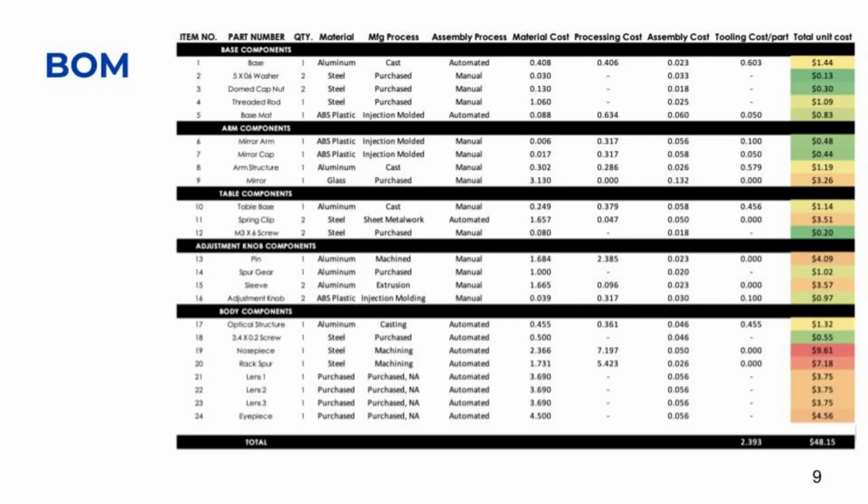In creating a bill of materials for a biological microscope, we opted to purchase standard parts such as fasteners, as well as complicated components like the lenses, while manufacturing all other parts. The cost of the purchased parts was determined based on similar or identical parts which could be purchased in bulk from hardware wholesalers. The material, processing, and tooling costs for the manufactured parts were determined from estimates provided by CustomPartNet.com. The total cost of each component is colorized at the far right.